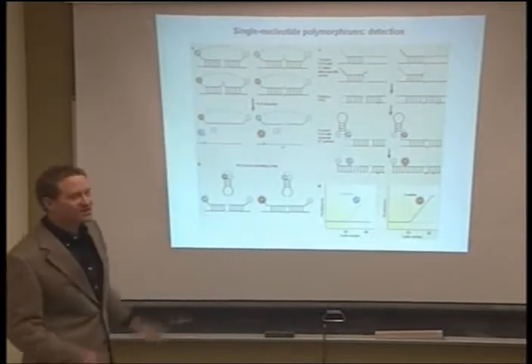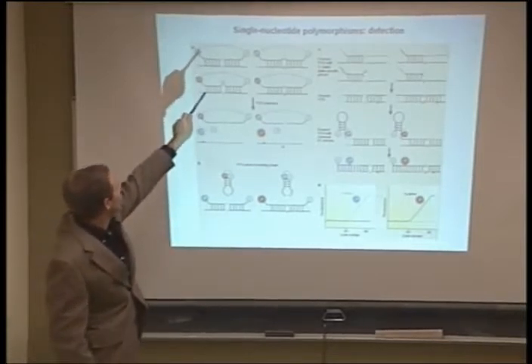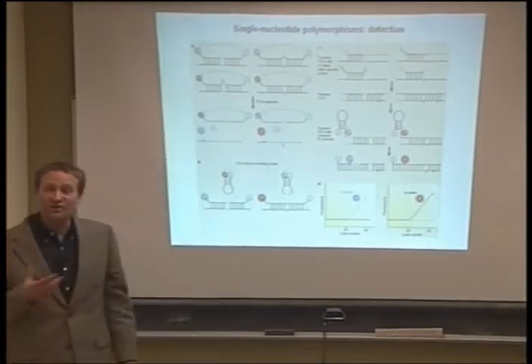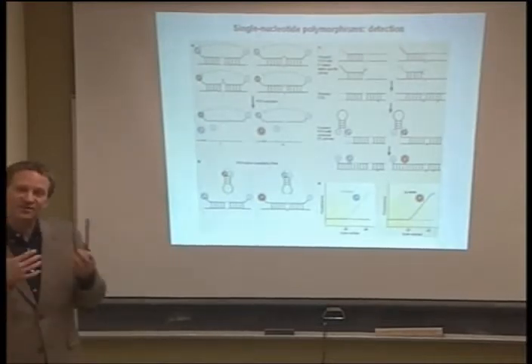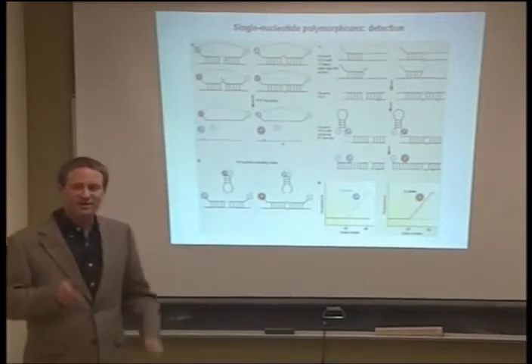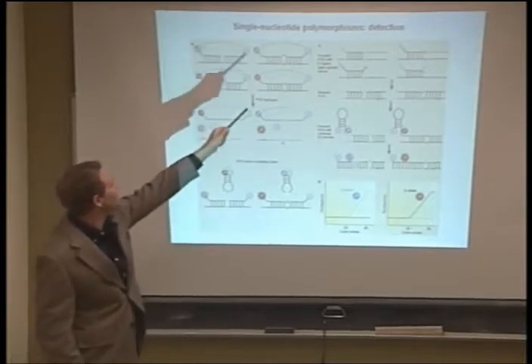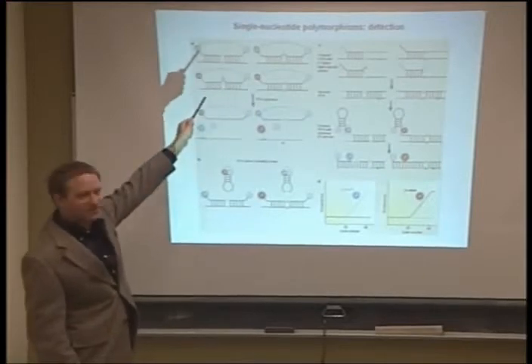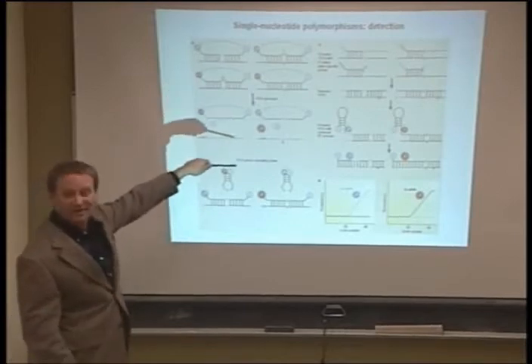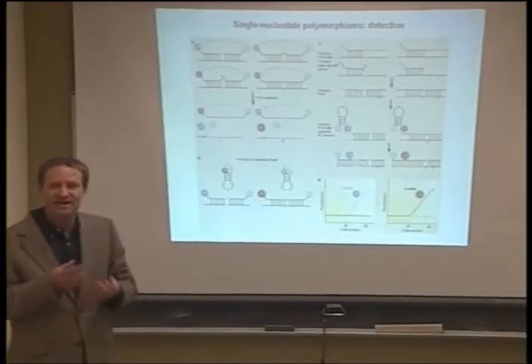And what allows you to distinguish these two reactions occurring, the two alleles in this case, is that this probe is labeled with one color, and this is labeled with a second color. These are fluorophores that in a lab you can detect with filters that measure one color versus another color of light. In the reaction, these probes, if they bind perfectly, are cleaved. And the last thing I need to tell you is that in this probe, you have a fluorescent molecule and also a quencher molecule. This quencher molecule interacts with that fluorescent molecule and keeps it from generating color. But during PCR, this probe, which sits down on the amplicon that's being made, gets cut if it's perfectly matched. And the fluor and quencher are separated and light is generated.